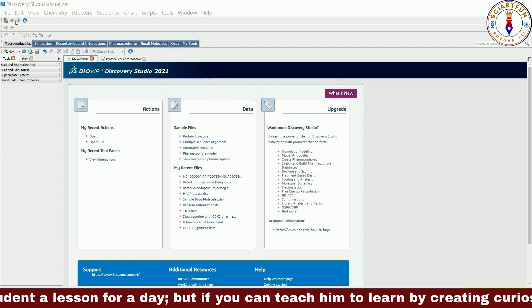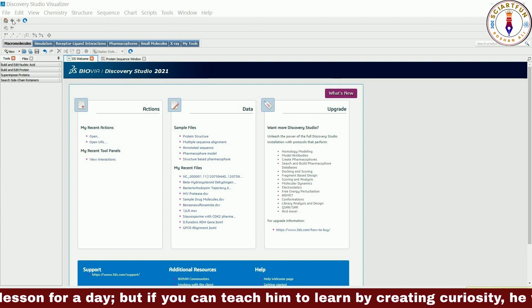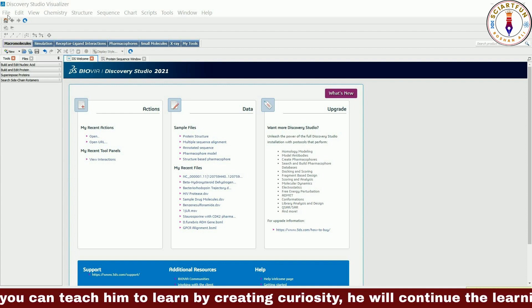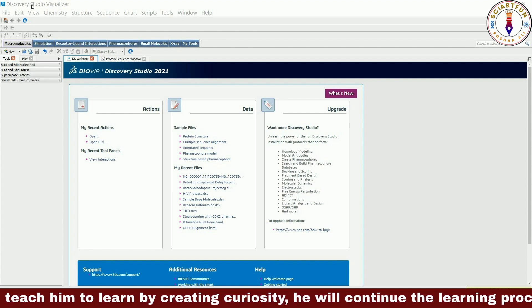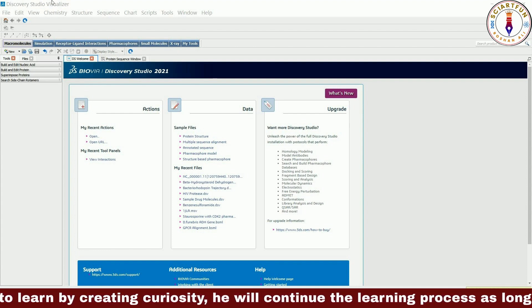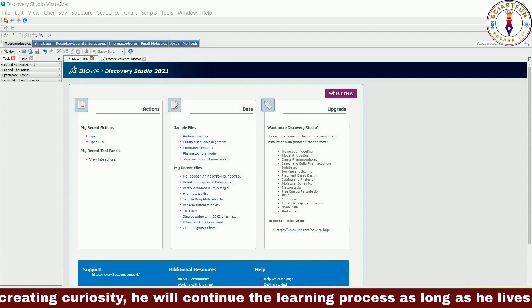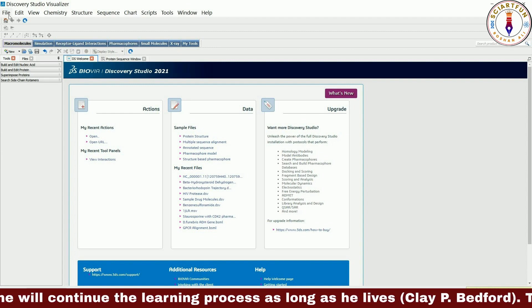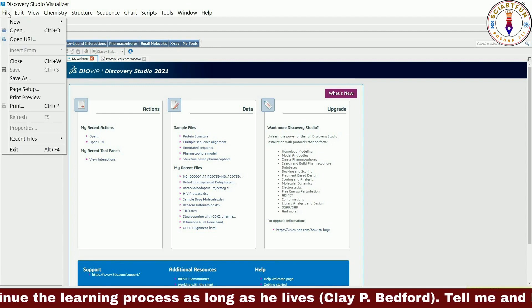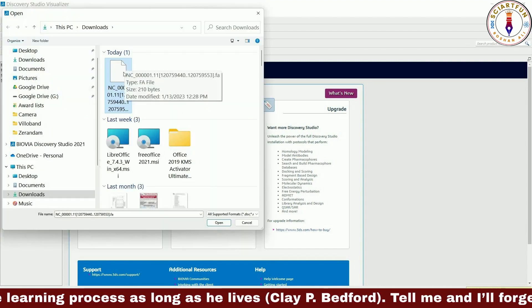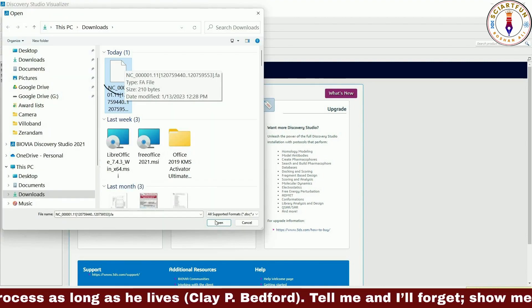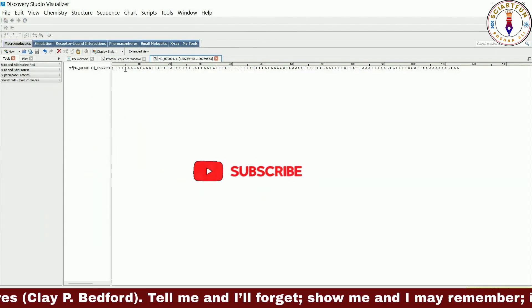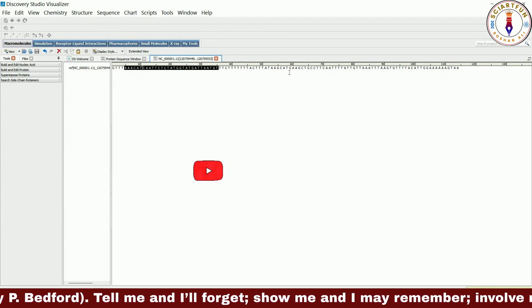First of all let's see how we can open a sequence window. There are several ways through which we can bring sequences into our sequence window. The first method is to open a sequence file. DS Visualizer can open several formats of sequences, for example FASTA format. For this purpose, go to the file menu, click open, go to the location where your sequence is saved, choose the file and click open. Our sequence is now opened in a sequence window.